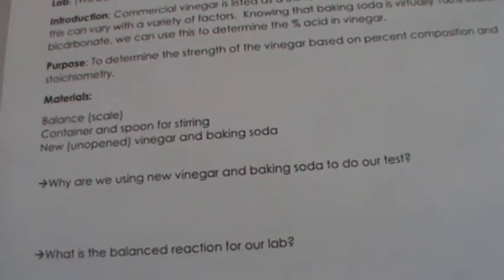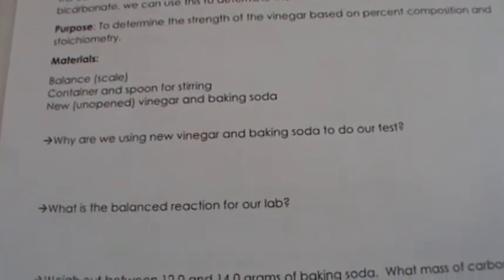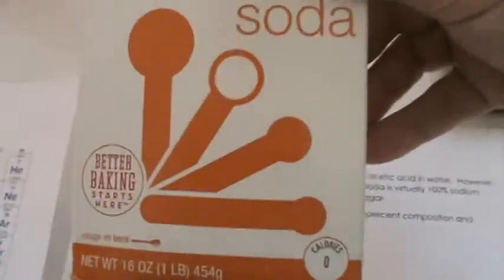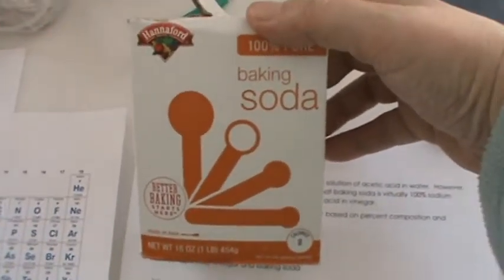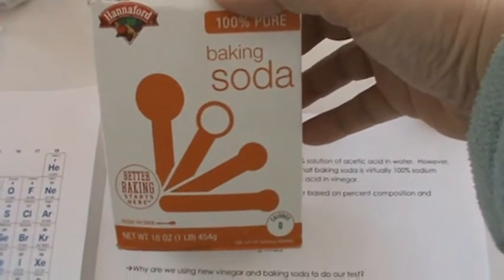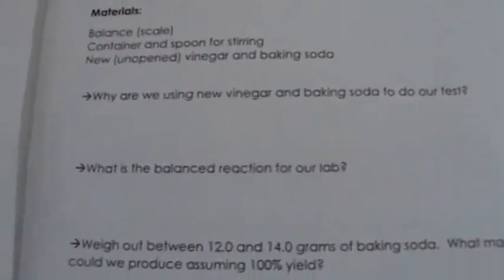Number one, baking soda could absorb moisture from the air, and so there's a potential that this isn't pure baking soda anymore, that it's baking soda with a little bit of water in it, and that would make our results potentially off. Now, the reason that you would ideally want to use new vinegar is that the old vinegar, the acetic acid in the vinegar will evaporate over time.